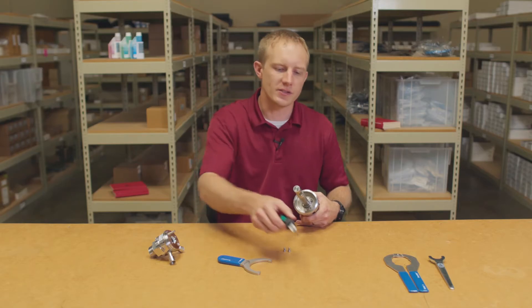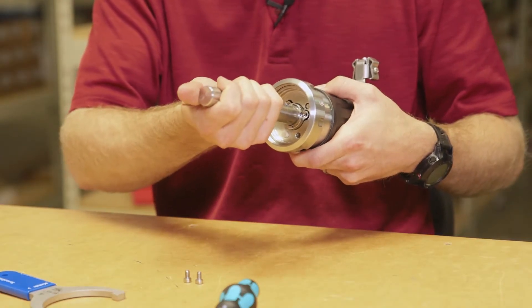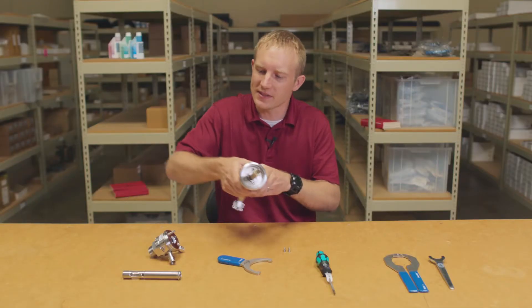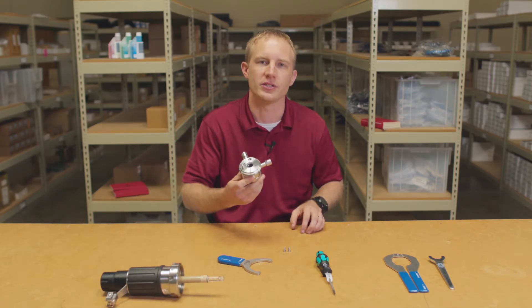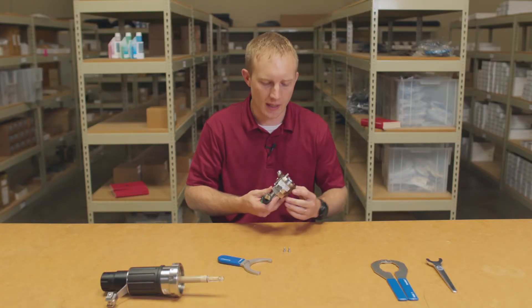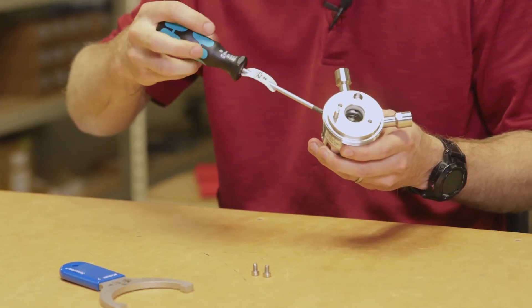We'll use the TX25 Torx screwdriver from our service tool set to loosen and remove these two screws. This allows the tube to be turned counter-clockwise. Align the tab so that you can pull and remove the tube from the assembly. The next step is to separate the cleaning and calibration chamber from the process connection. To do so, we'll use our TX25 screwdriver again to loosen and remove the two screws that hold the pieces together.